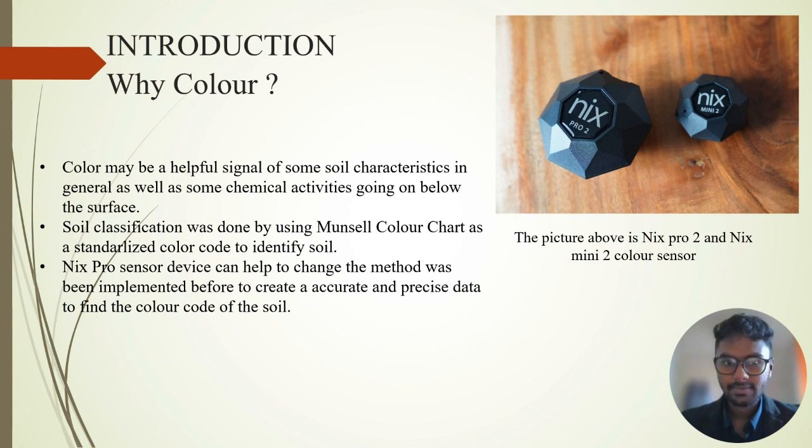The NIX Pro sensor device can help to change the method that was being implemented before, to create accurate and precise data to find the color code of the soil. The picture shown in the slide is the NIX Pro 2 and NIX Mini 2 color sensor.